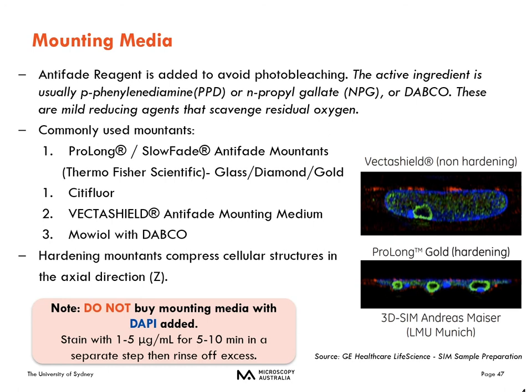You can always add the last step of staining with 1 microgram per mil for 5 to 10 minutes as a separate step, and then rinse off the excess DAPI, and then you can mount your sample.